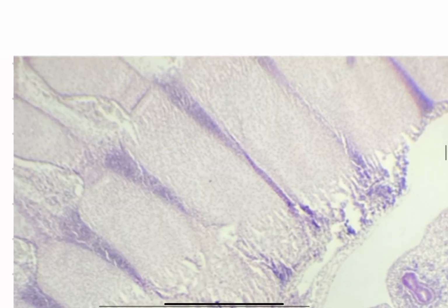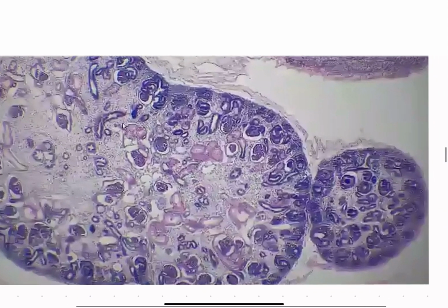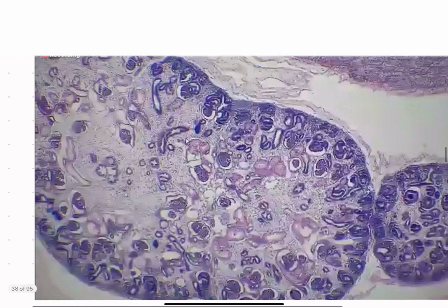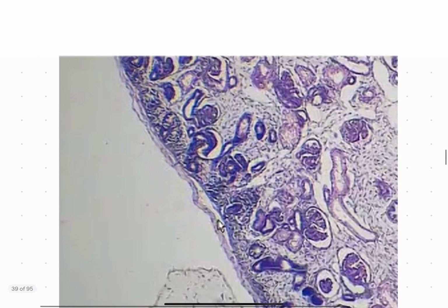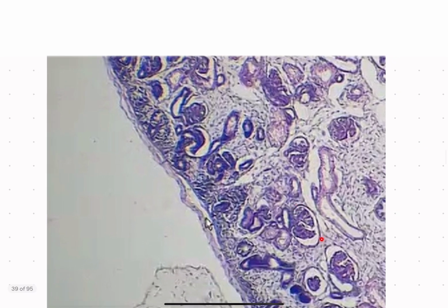All right. Next slide. We see this. Please write down the slide name. I would like to zoom in towards this area-ish for us to see this. Please write down the structure name of this structure.